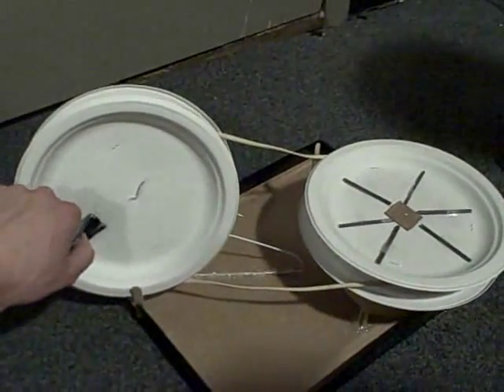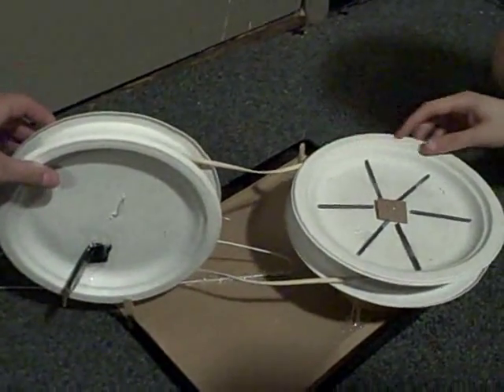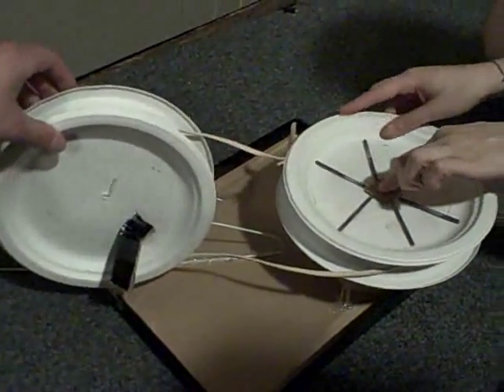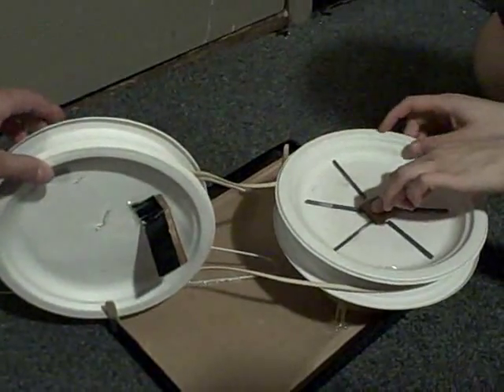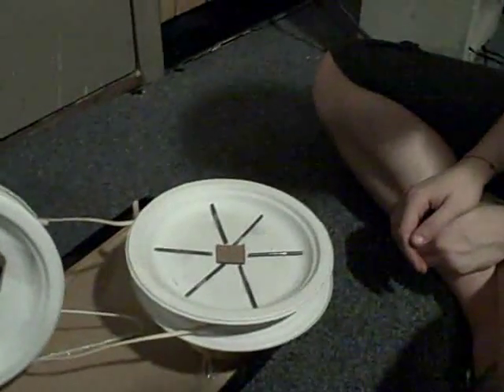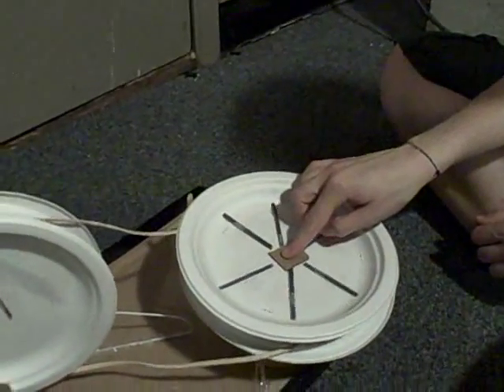This wheel is the wheel that will be connected to the bike. It will drive a belt that will then drive the plate that has the hematocrit tubes on it. It will be arranged in a pattern as you see here.